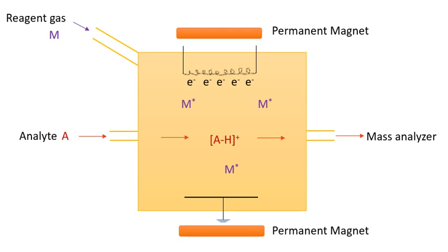Topic: Variants. Topic: Negative chemical ionization. Chemical ionization for gas phase analysis is either positive or negative. Almost all neutral analytes can form positive ions through the reactions described above. In order to see a response by negative chemical ionization, NCI, also NICI, the analyte must be capable of producing a negative ion, or stabilize a negative charge, for example by electron capture ionization.